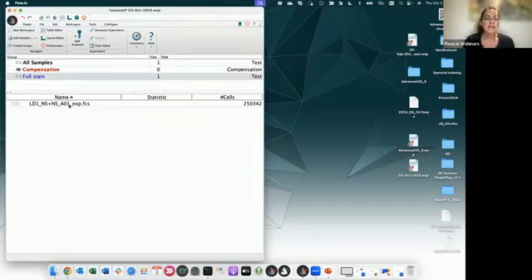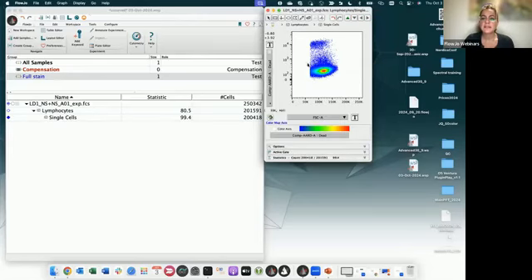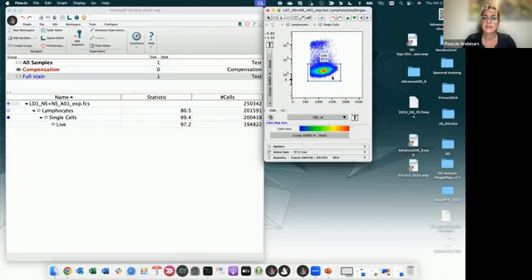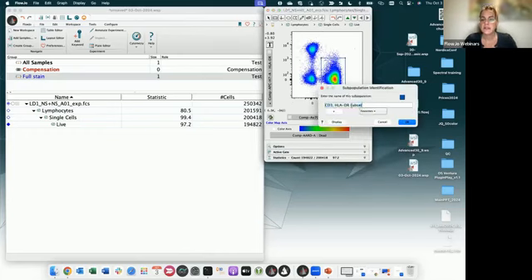So back to the template. If I start now to create a gating strategy, okay, let's say these are my lymphocytes, and then within my lymphocytes, I just want to create a gating strategy that goes with 2 or 3 gates, okay? And then I have that. I'm going to create just a quick gating strategy for that, so at least we have a few gates to play with. Okay.